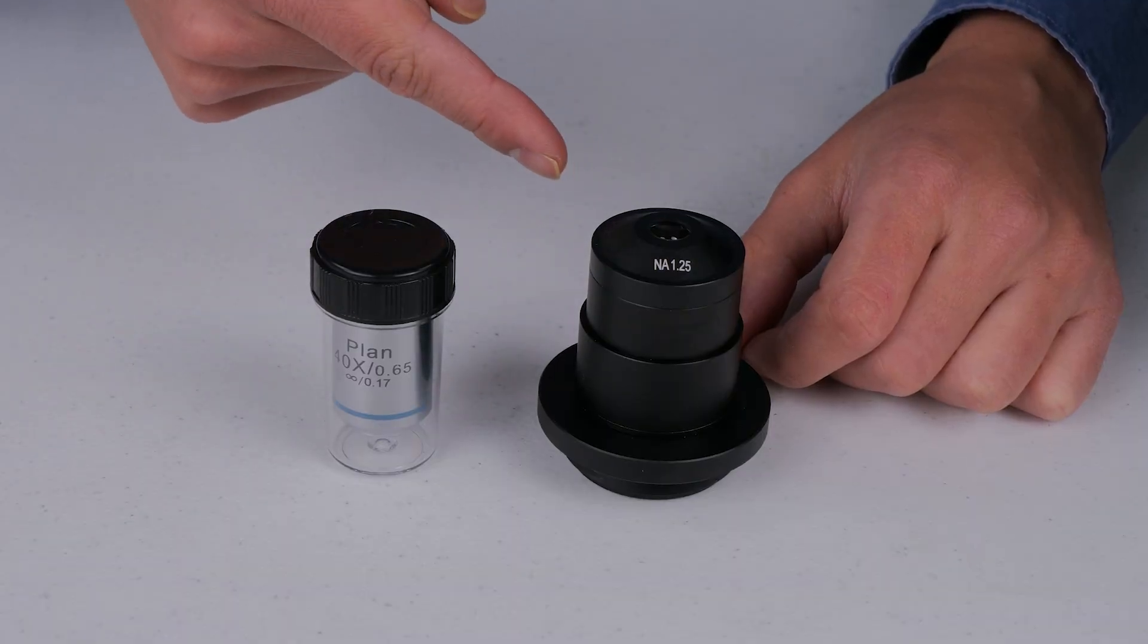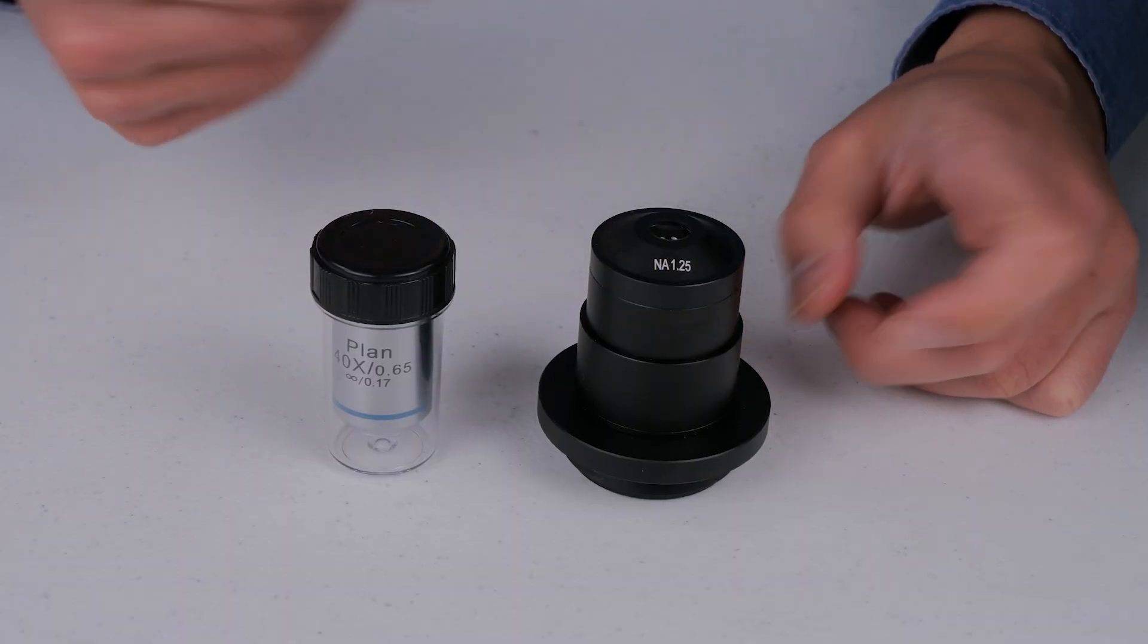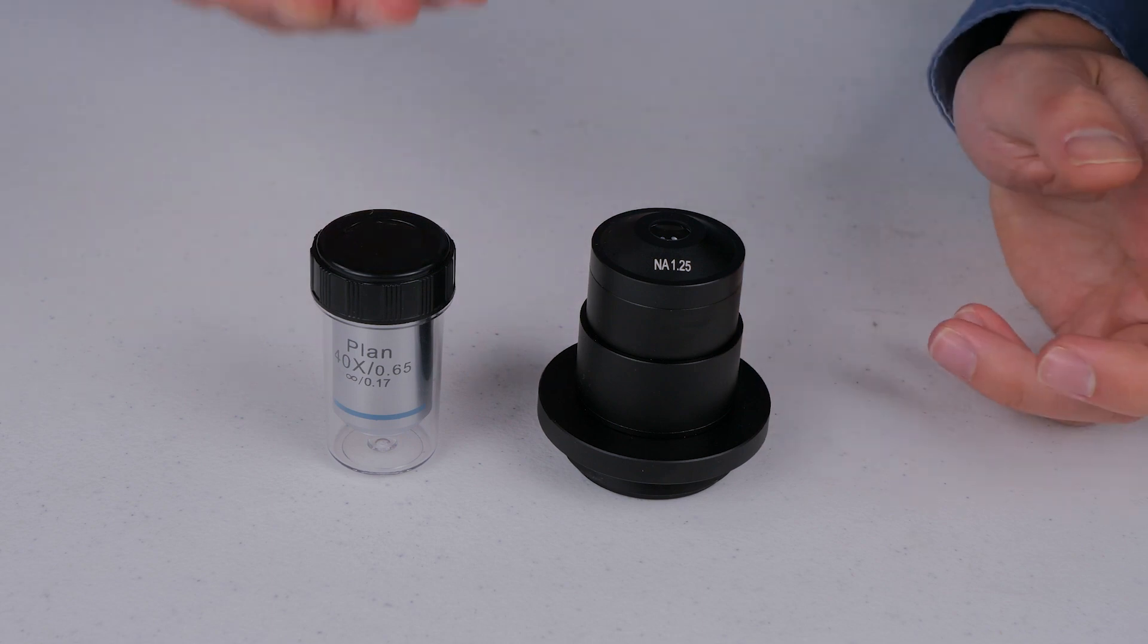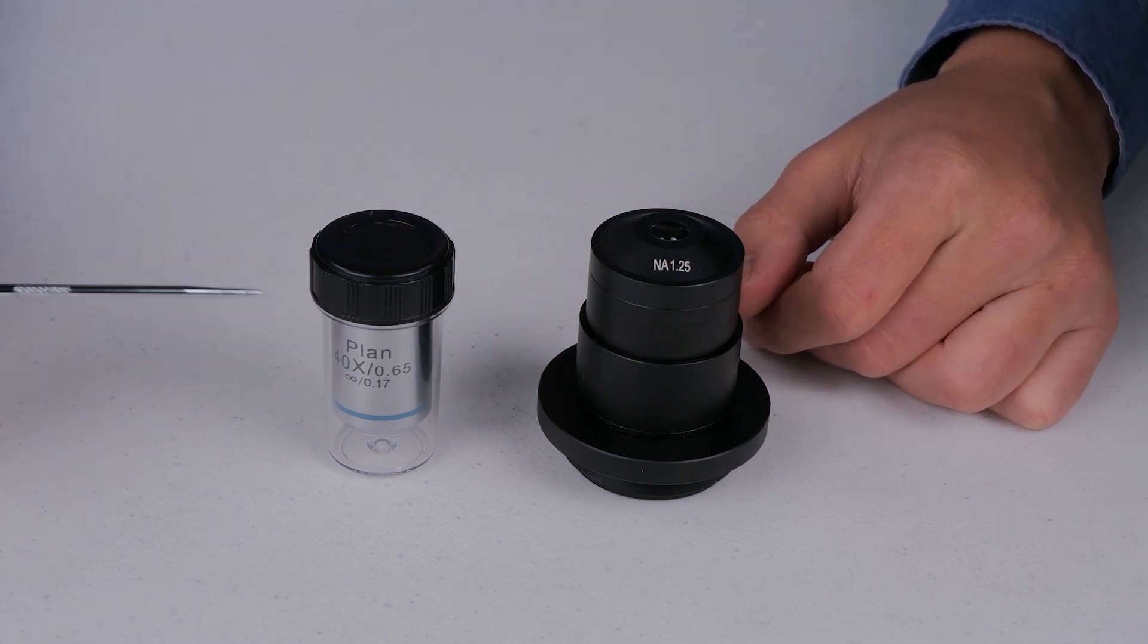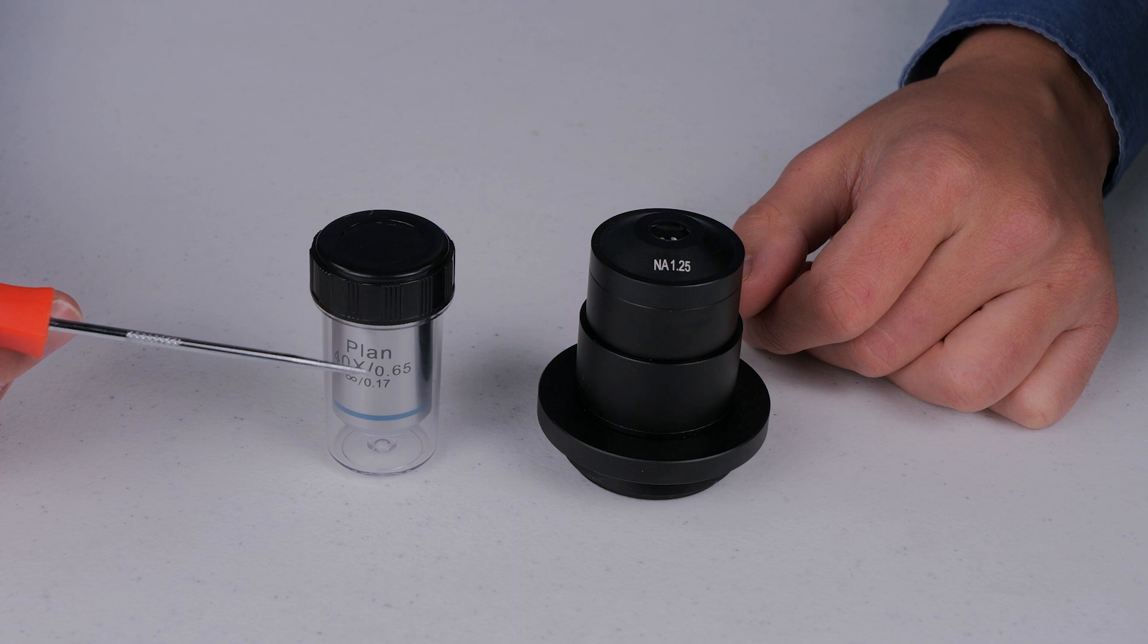So both the objective and the condensers say what their numerical apertures are, but why? Why is it important what the condenser's numerical aperture is? Well the thing to understand is that on an objective this numerical aperture is fixed. It's always going to be 0.65.